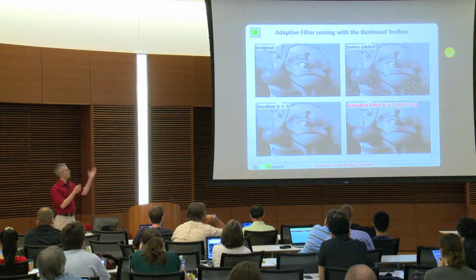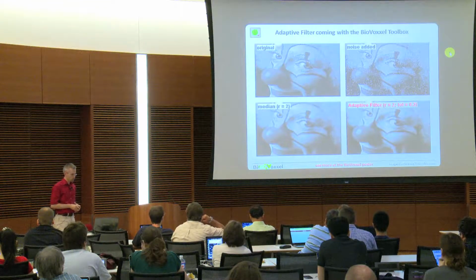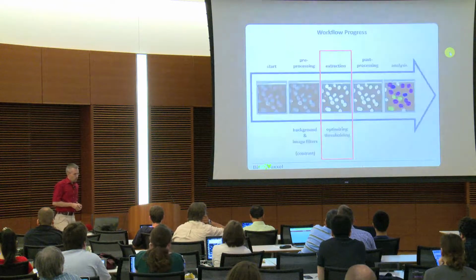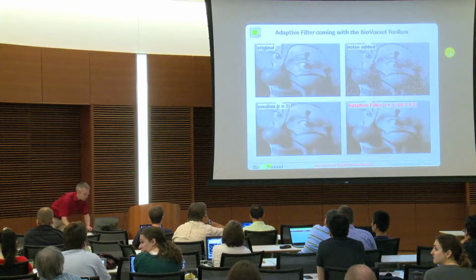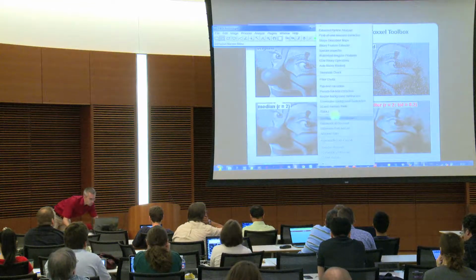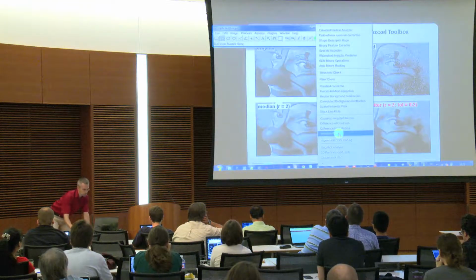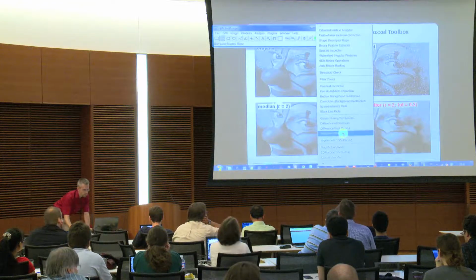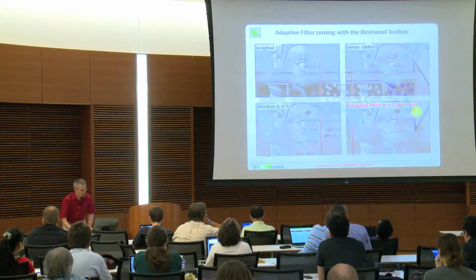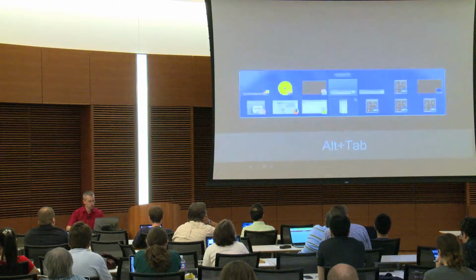If you want to talk about that in detail, how it works, we can do that also outside at the poster later on. This is also, if you go to the toolbox, here it's the adaptive filter. Potentially, time-wise, I'll try to show you that shortly.